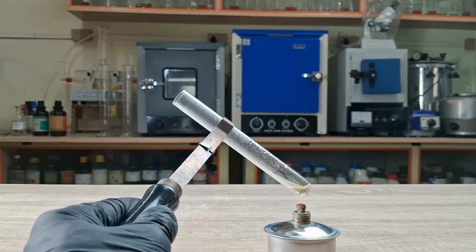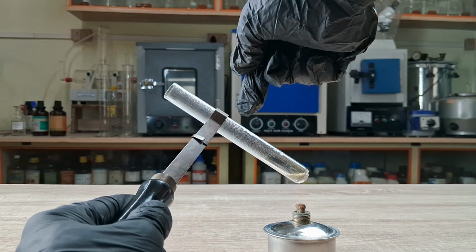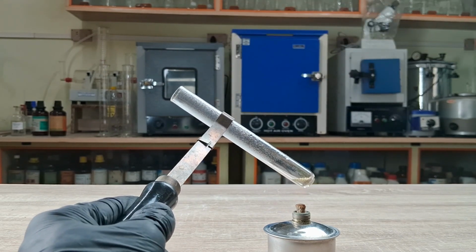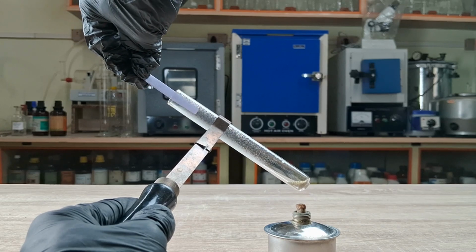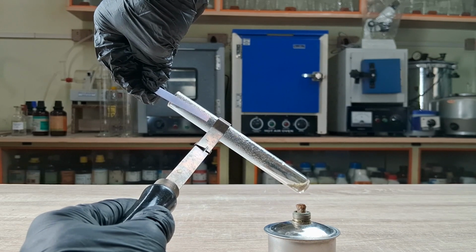A slight whiff of the fumes present a characteristic odor of burning sulfur. A strip of moistened blue litmus paper, when placed near the mouth of the test tube, also turns red, indicating that the fumes are acidic in nature.